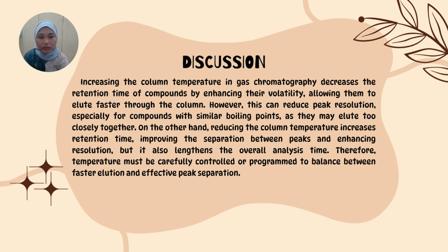On the other hand, reducing the column temperature increases the retention time, improving the separation between peaks and enhancing resolution. But it also lengthens the overall analysis time. Therefore, temperature must be carefully controlled or programmed to balance between faster elution and effective peak separation.